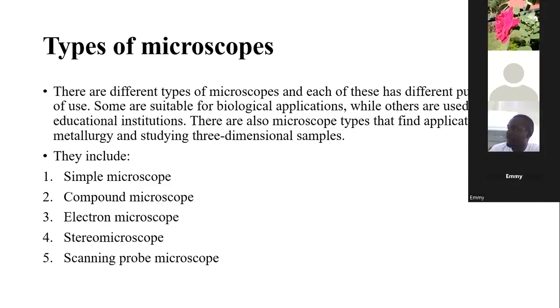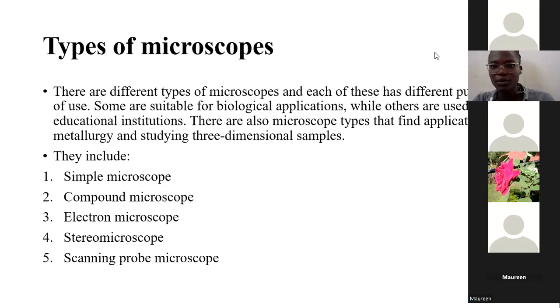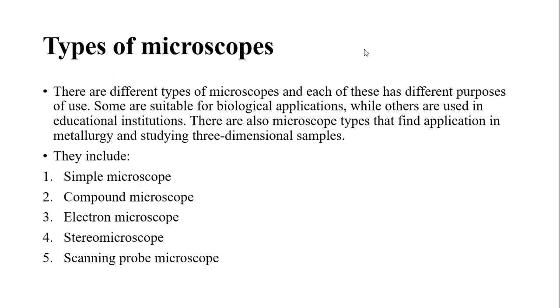Types of microscopes. There are different types of microscopes, and each has different uses. Some are suitable for biological applications, while others are used in educational institutions.